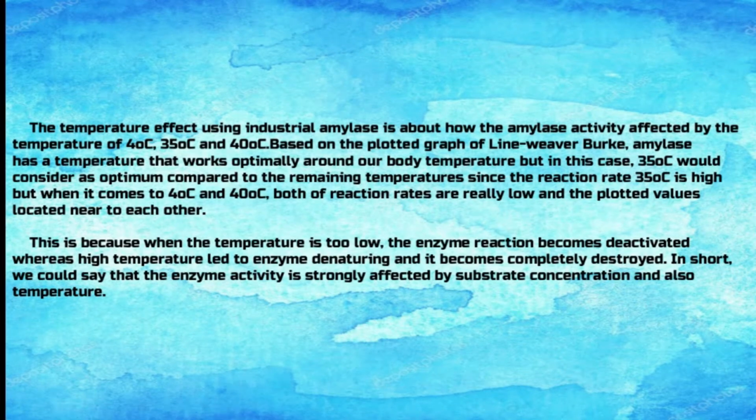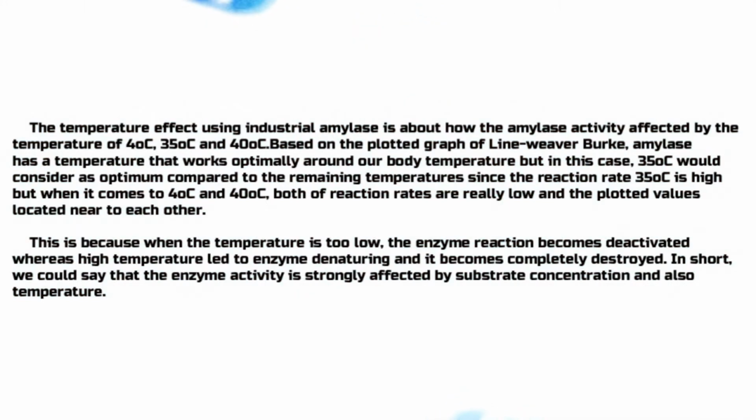This is because when the temperature is too low, the enzyme reaction becomes deactivated, whereas high temperature leads to enzyme denaturing and it becomes completely destroyed. In short, we could say that enzyme activity is strongly affected by substrate concentration and also temperature.